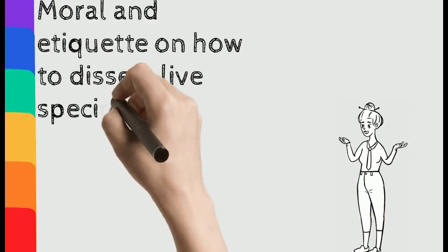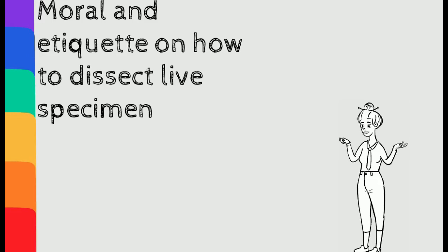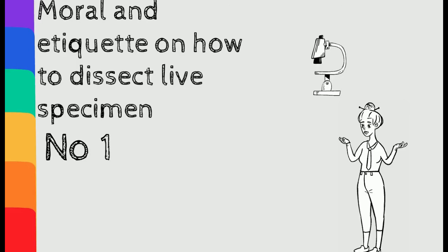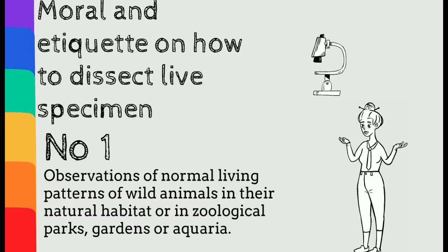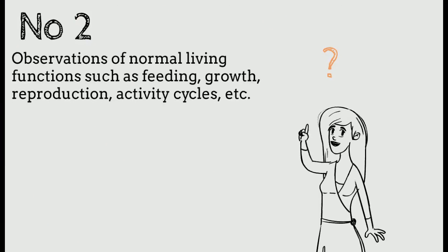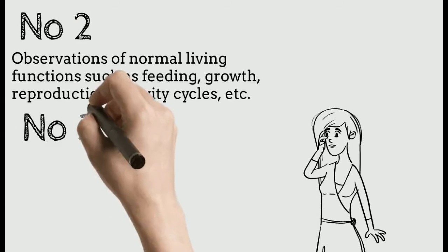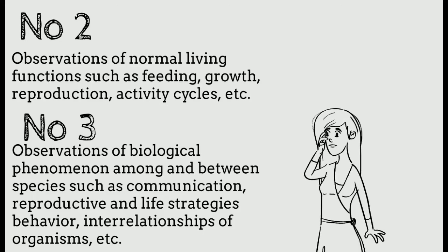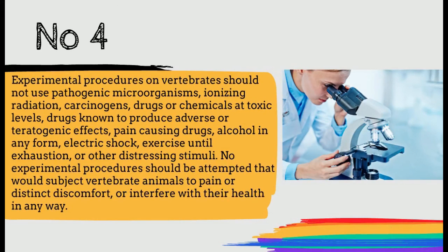Moving on to the moral and etiquette guidelines on how to dissect live specimens. Some guidelines must be followed when live animals are used in the classroom. Multiple animals can be used as experimental organisms in the following situations: observation of normal living patterns of wild animals in their natural habitat or in true biological settings; observation of normal living functions such as feeding, growth, reproduction, and activity cycles; and observation of biological phenomena among and between species, such as communication, reproductive and life strategy behavior, or the relationships of organisms.